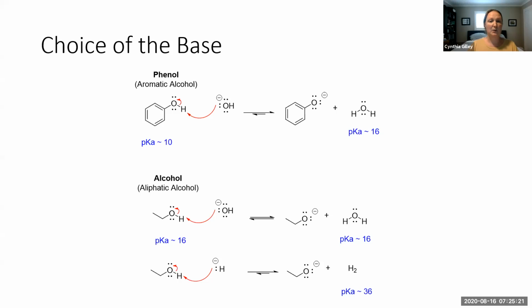Sodium hydride is more reactive as a base, so it's more difficult to handle. You have to be careful to not expose it to too much water, which can come from the atmosphere, and that can decompose the product. So it's not as easy a reagent to work with. So that's one advantage in being able to use hydroxide.